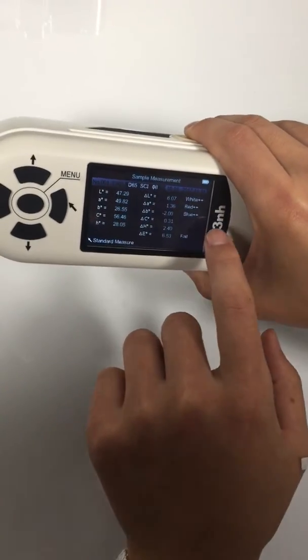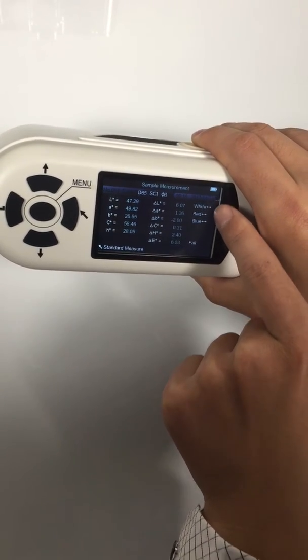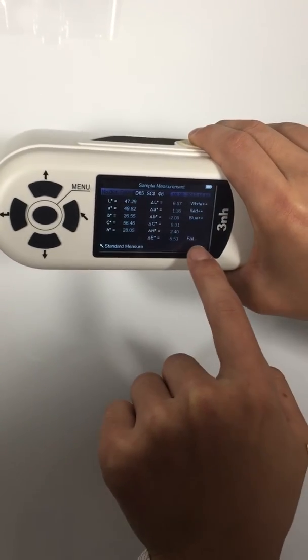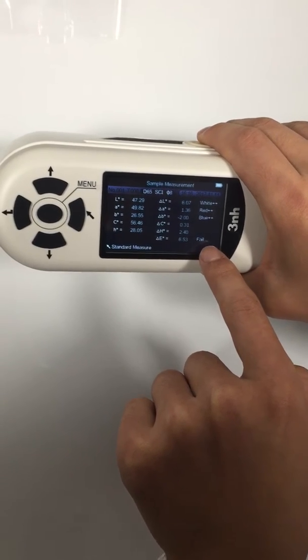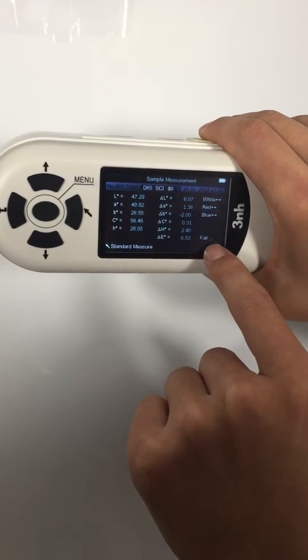This is the test result. This is the color offset indication, and this is the color test result judgment. Because the delta E is too large, it shows fail.